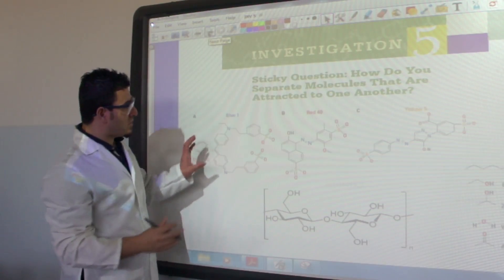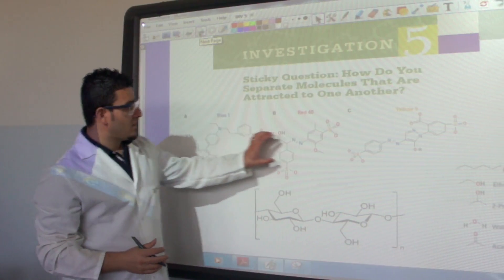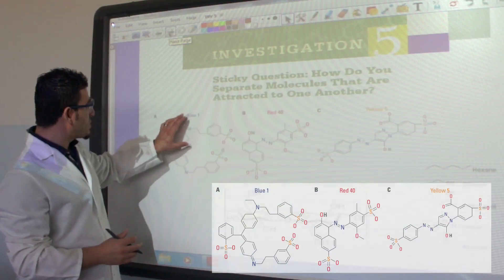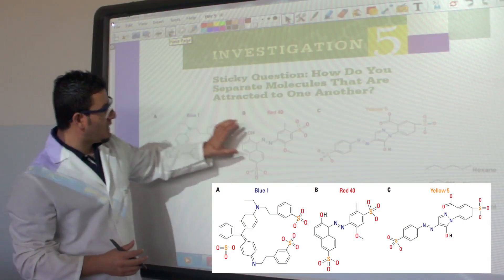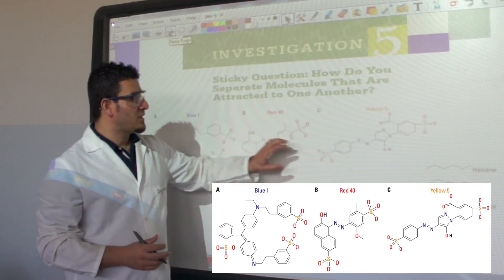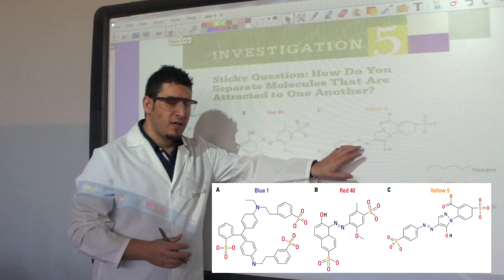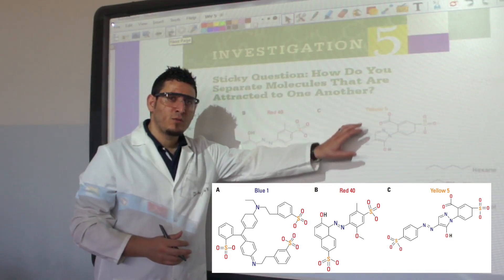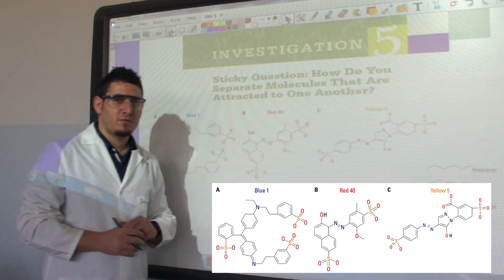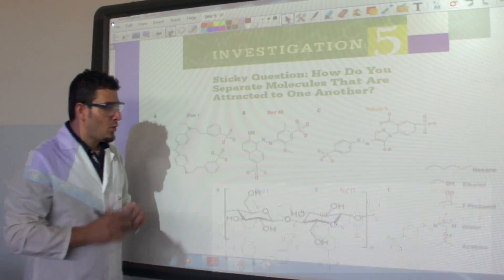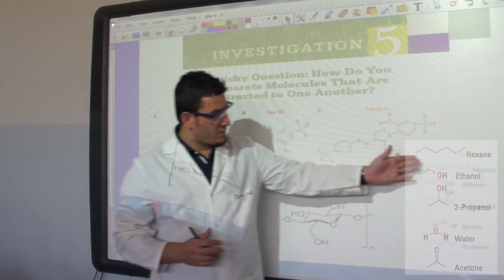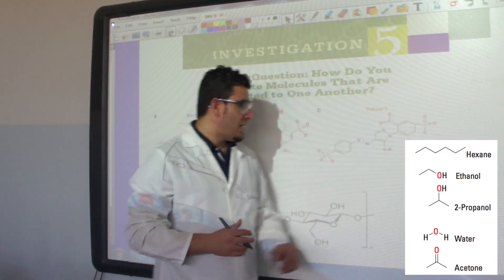In today's example we have a mixture of three dyes: the blue dye called Blue 1, the red dye called Red 40, and the yellow dye called Yellow 5. We are going to use five different solvents.